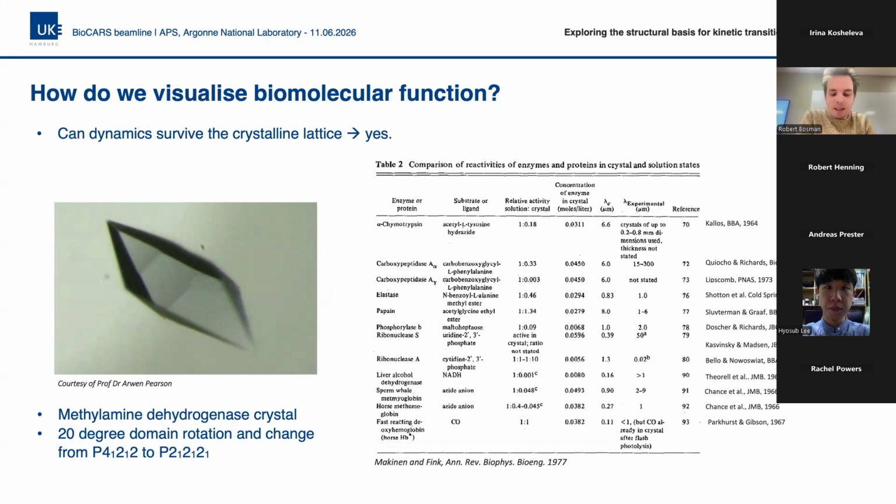And they actually calculate a critical depth, which assesses how big your crystal can be before you start to become diffusion limited. We've actually found that you can do quite successful time-resolved experiments with slightly larger crystals than indicated here, but it's important to remind ourselves that the time-resolved experiment in enzyme catalysis is quite different to a photo-triggered experiment. You have to think quite carefully about the kinetics of what you're measuring, in a way that is maybe a little easier if you have a very rapid photosystem response in a light-triggered system, and particularly about questions of diffusion.